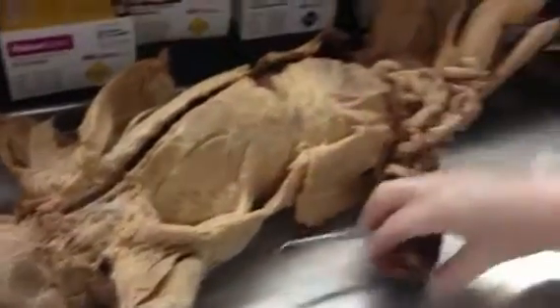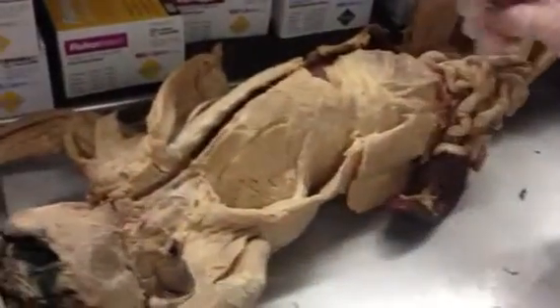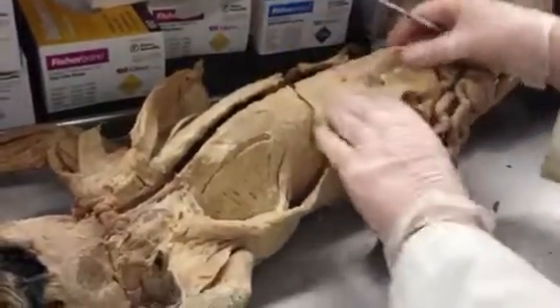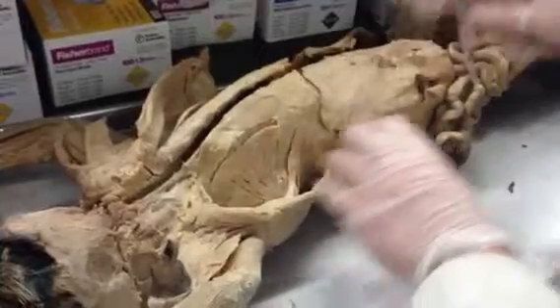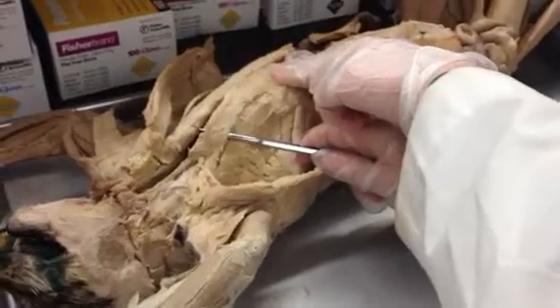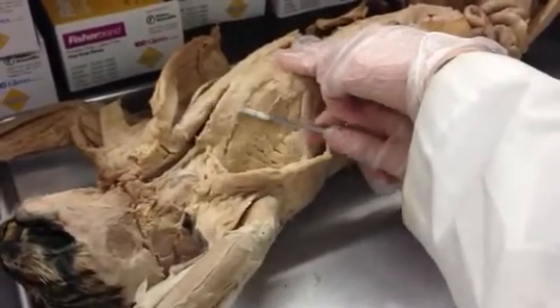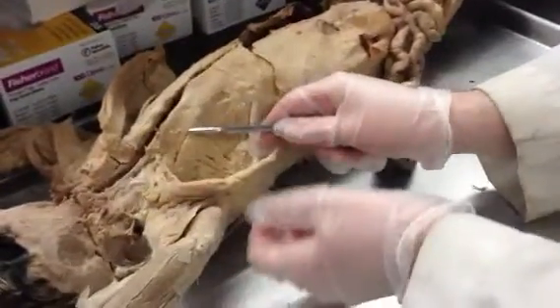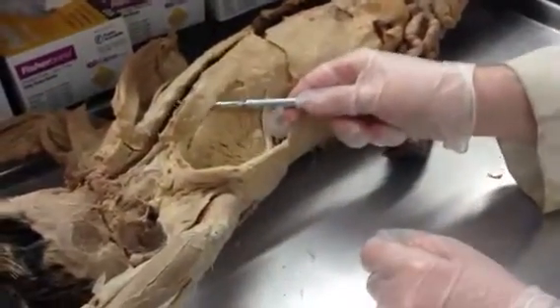Remember the rectus abdominis, which we're going to talk about in a minute — it runs straight up the abdomen. Here's the rectus abdominis; it goes straight up the abdomen, and all of a sudden it crosses over here. This is what I call the exit ramp of the rectus abdominis — that's called the transversus costarum. This is the transversus costarum right here; it's very big in this cat.